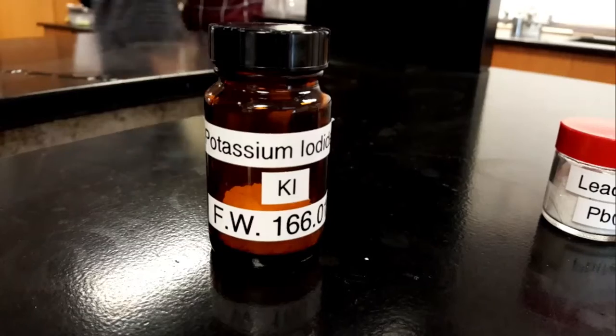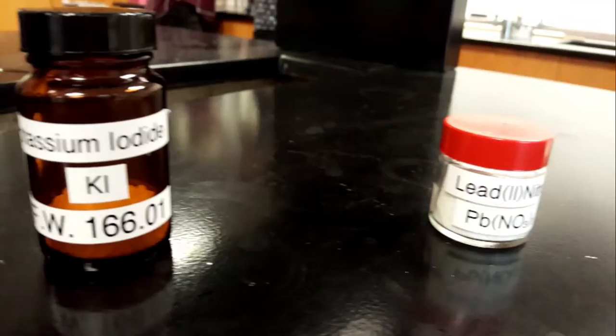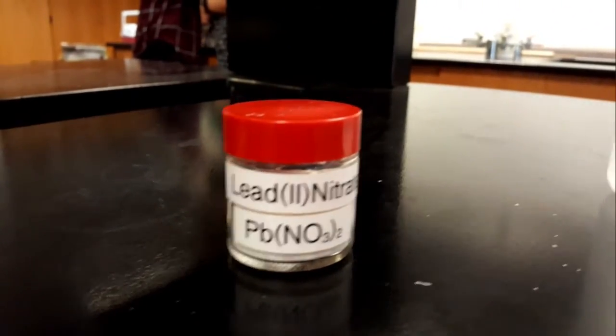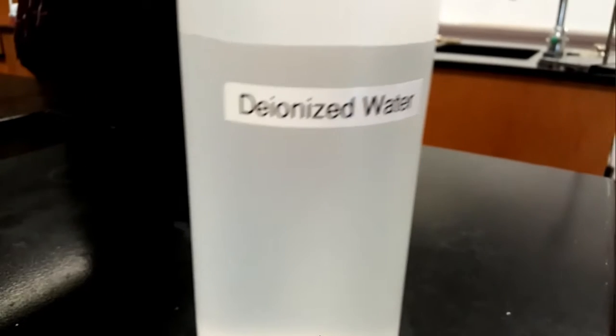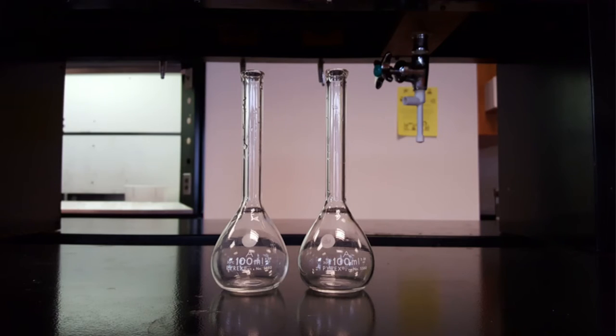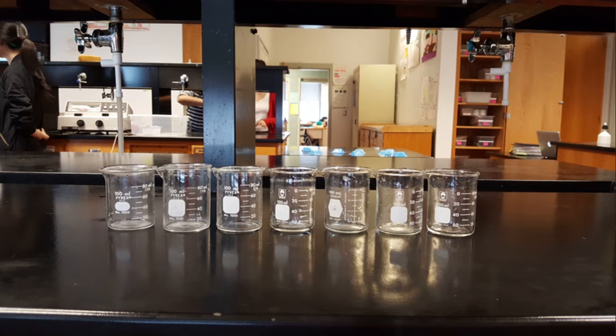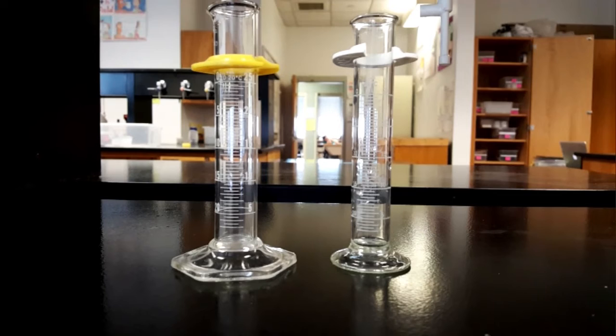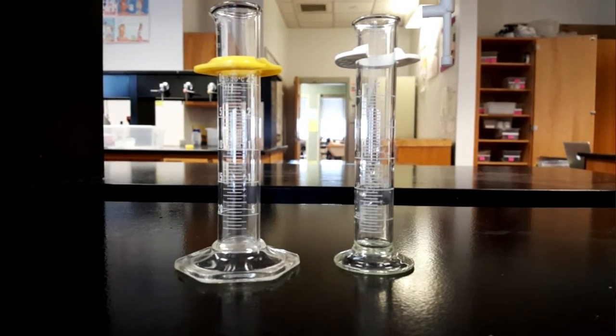The materials needed are potassium iodide, lead nitrate, and distilled water. Two 100-milliliter volumetric flasks, seven 100-milliliter beakers, and two 25-milliliter or 50-milliliter graduated cylinders.